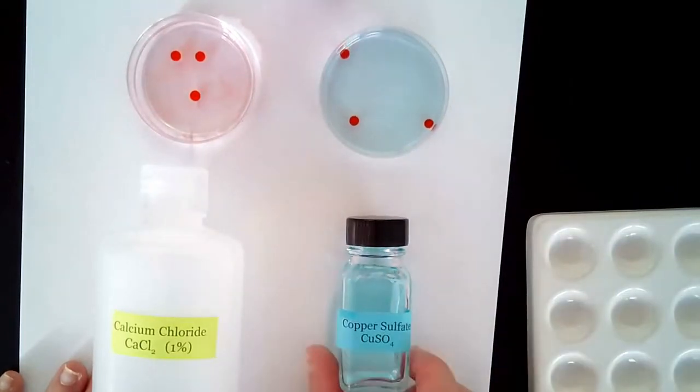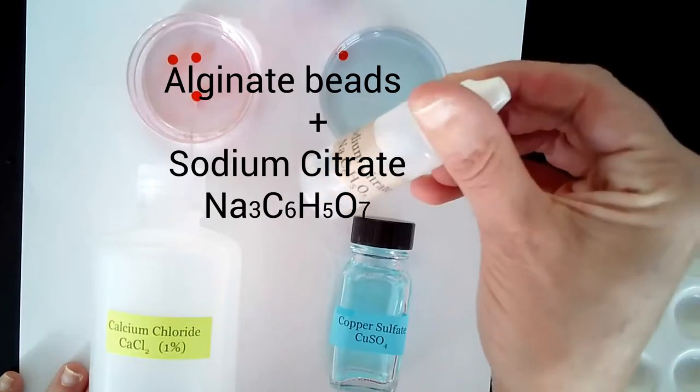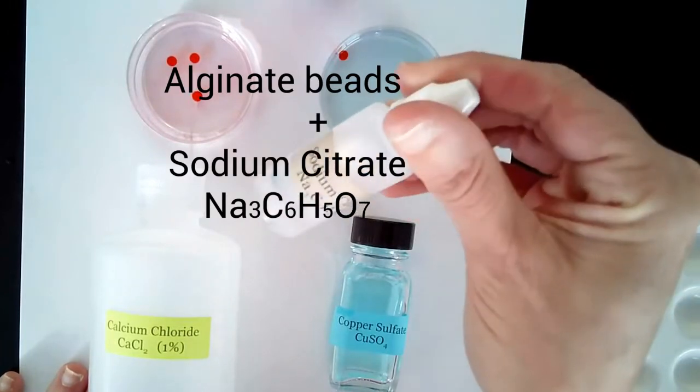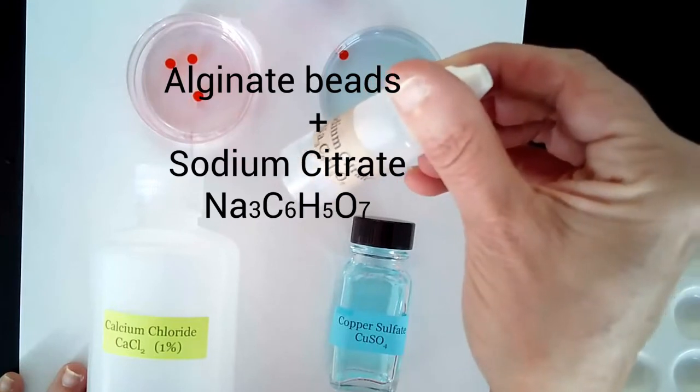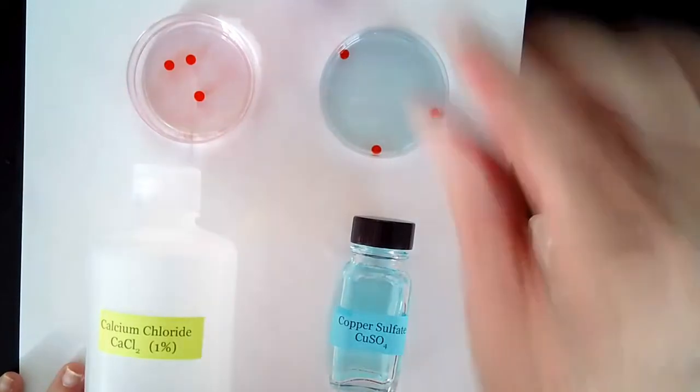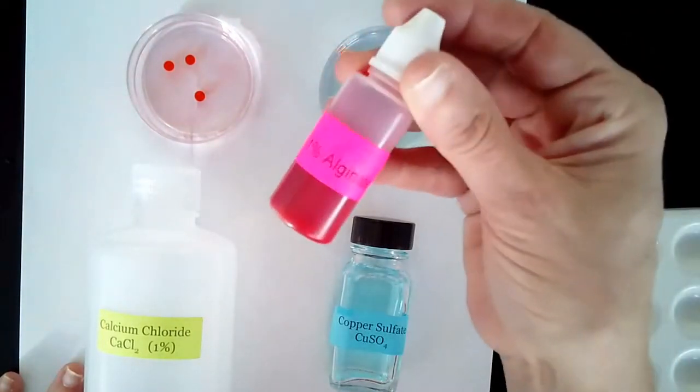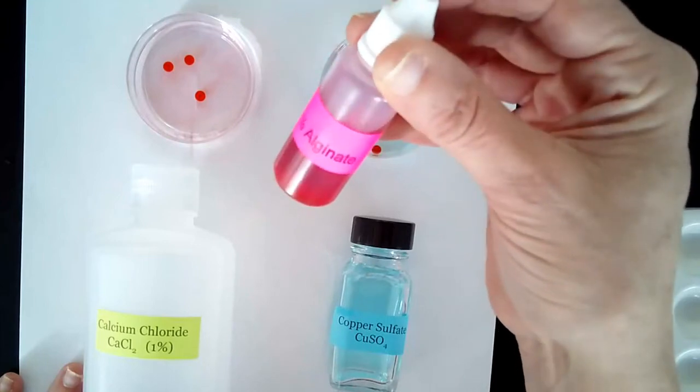In today's lab you are going to see what happens to the alginate beads when you add sodium citrate to the beads. To start, let's just review what kind of beads you can make. Keep in mind we have the alginate and it's pre-made and it's pretty red colored from the food coloring.